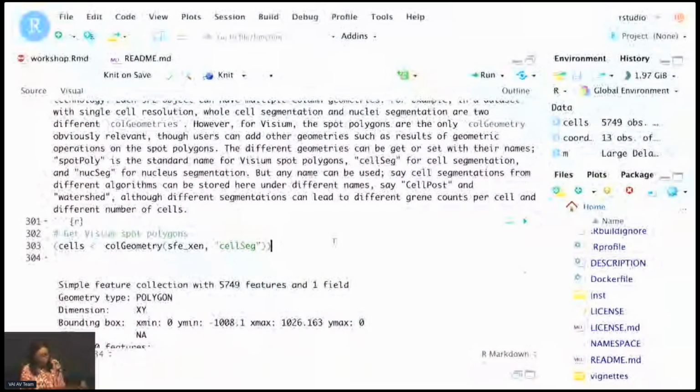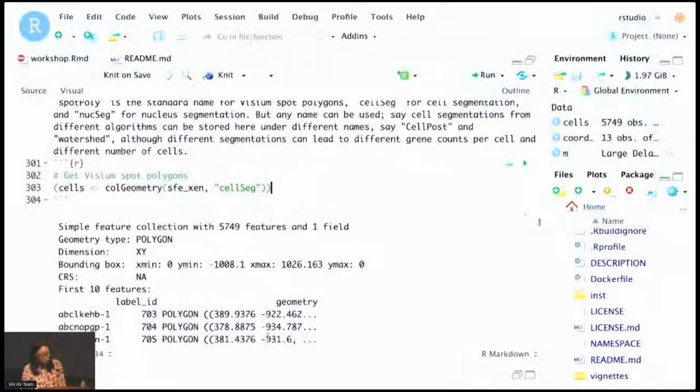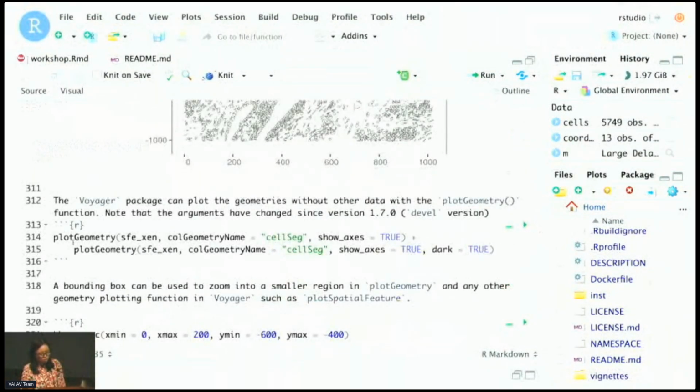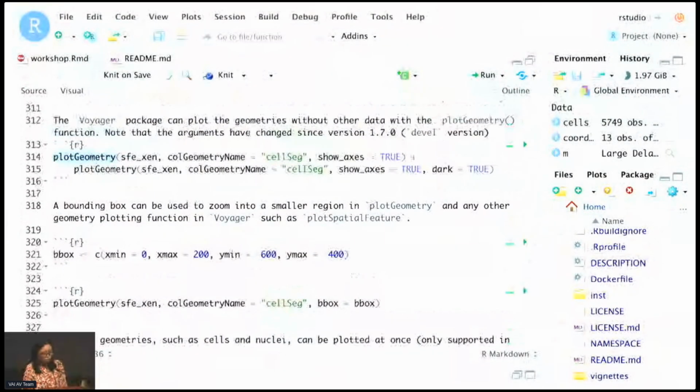But instead of using the getter to get the geometries and directly calling ggplot to plot it, there's also in the Voyager package the plotGeometry function. And in order to plot the colGeometry, we populate the colGeometryName argument. Also there's a light theme, which is default, and a dark theme; you put dark equals TRUE to use the dark theme if that's your personal preference.